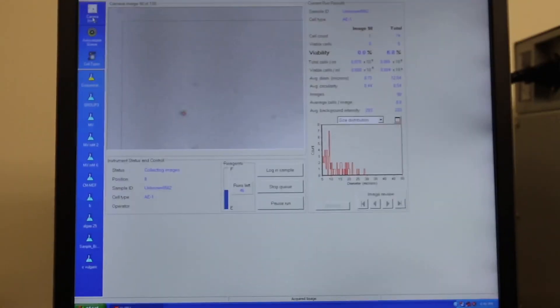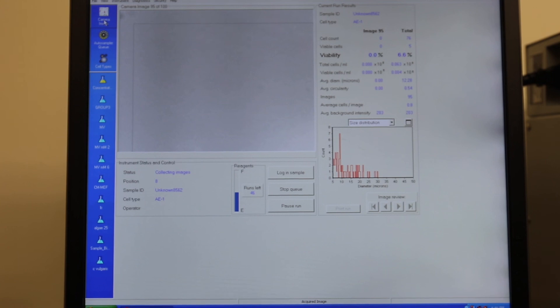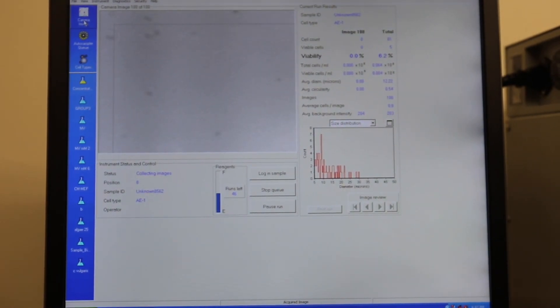When viewing the images taken of the samples, if you see cells being counted that shouldn't be, you can manually go back and change the parameters.